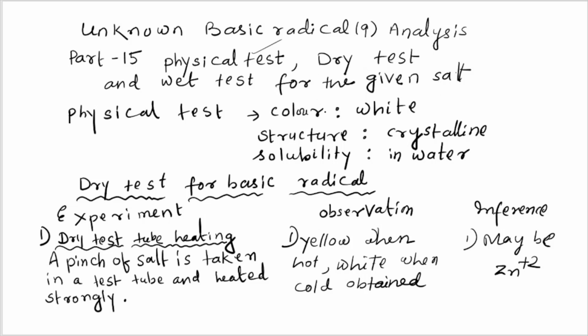Physical test, what are the main important points? You will see the color: the salt given is white in color. Next you will see that the salt is crystalline in nature and soluble in water. This completes the physical test. Then you will come to the dry test.